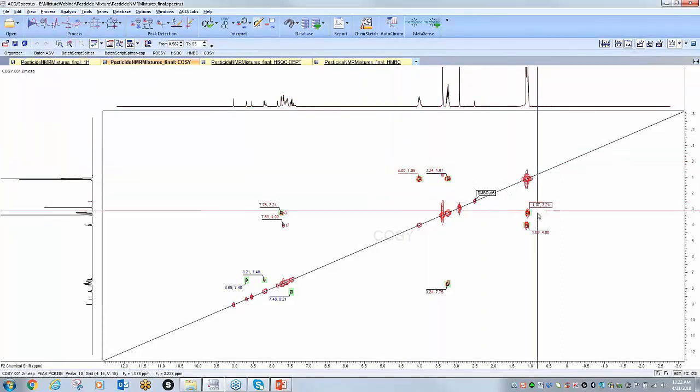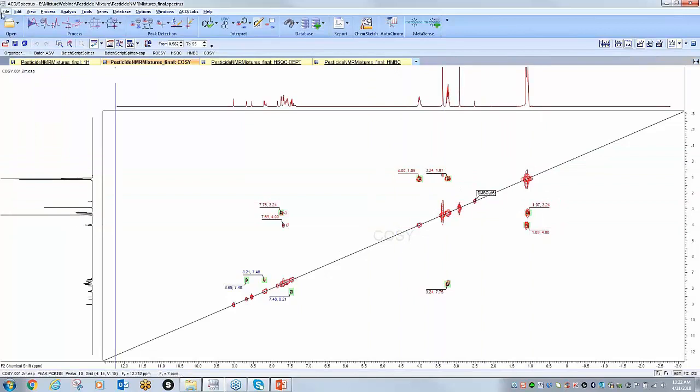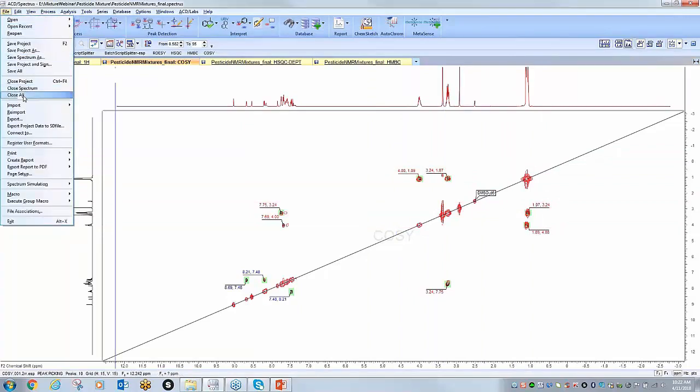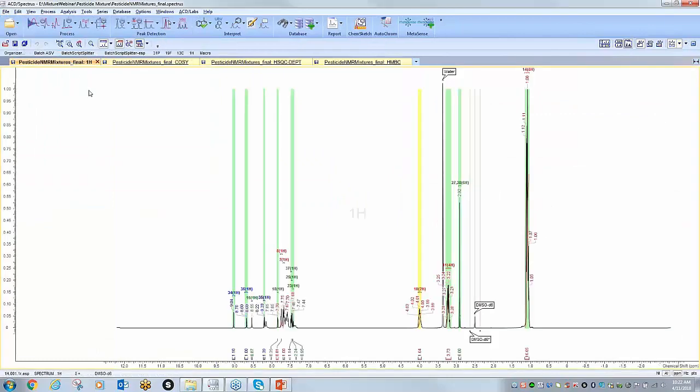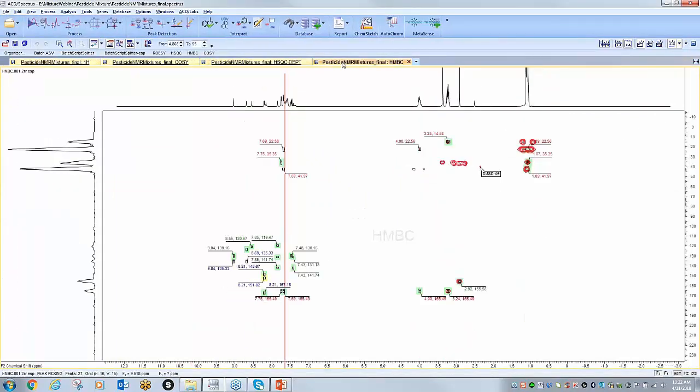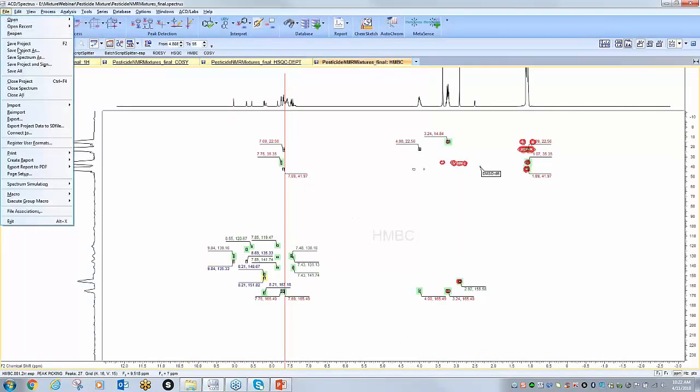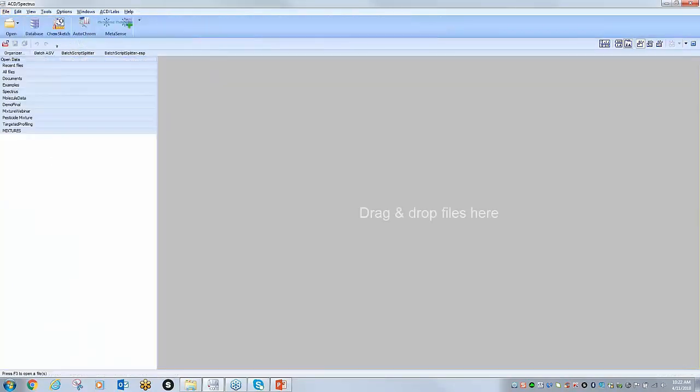I'm going to show you how you can quickly get to this final result of all these different constituents that are present. So let me open one where there has not been the analysis to show you how quickly and easily you can get to that final answer.